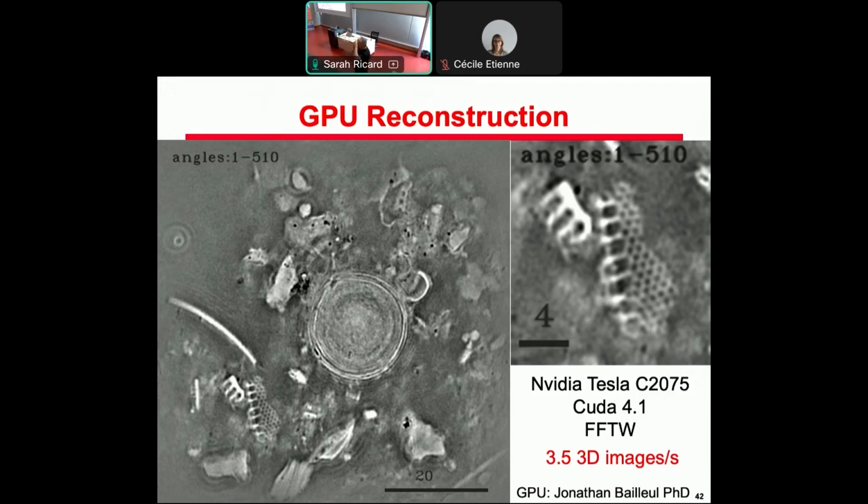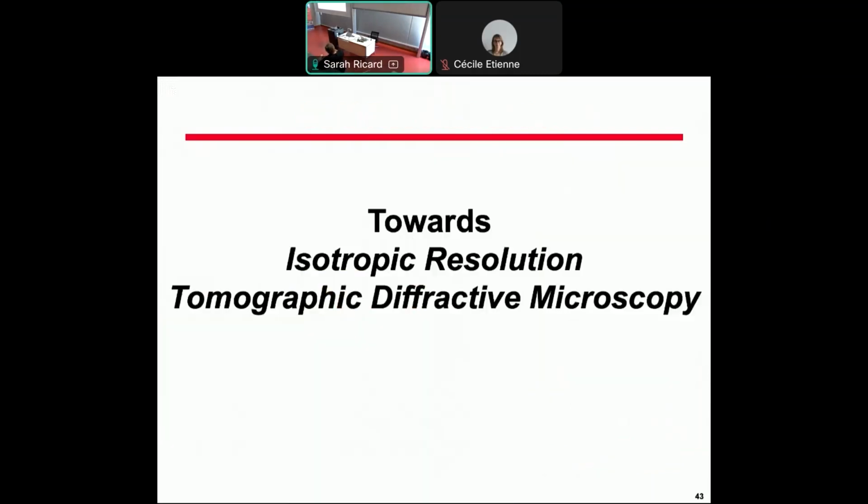5,000 frames per second, megapixels, live. There are some systems, but they are expensive. But it's only a technological problem and a financial problem. It's not fundamental.